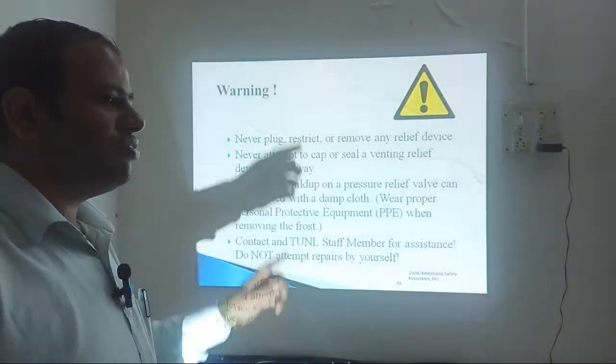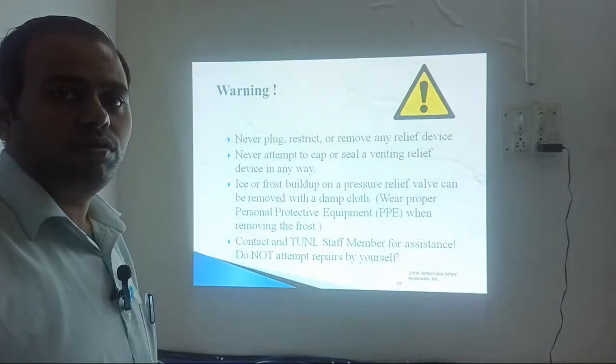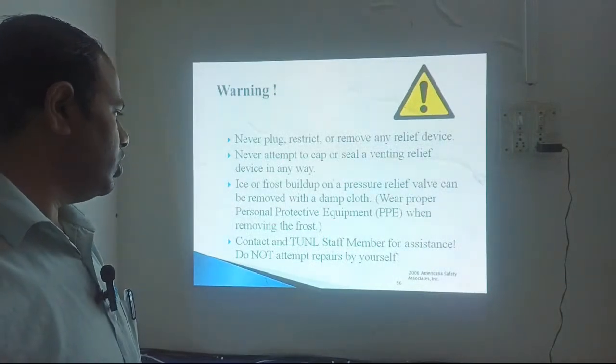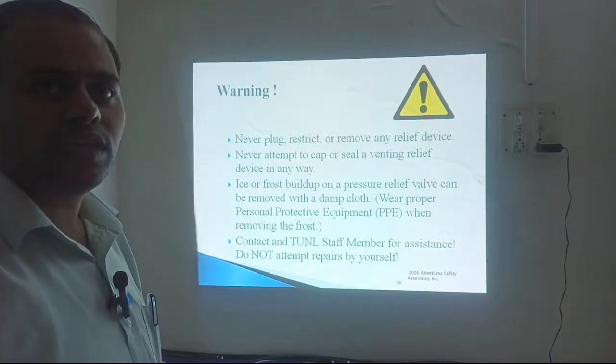Such signs are always placed where the different kinds of instruments are used. The instruments should be certified. They are certified by different companies, and these kinds of symbols or warning signals are also given.